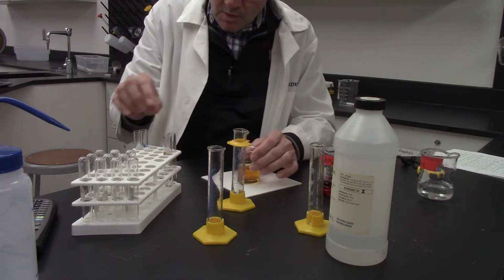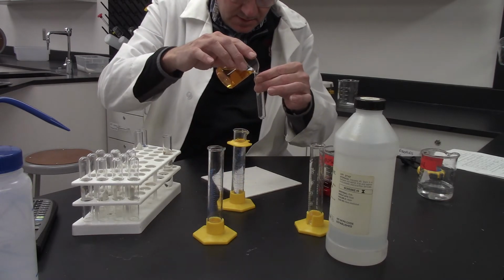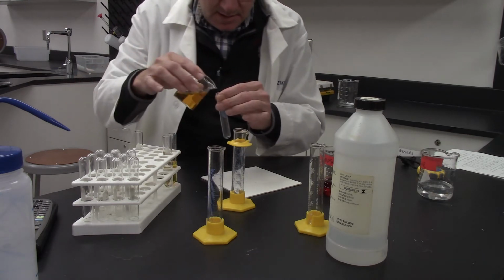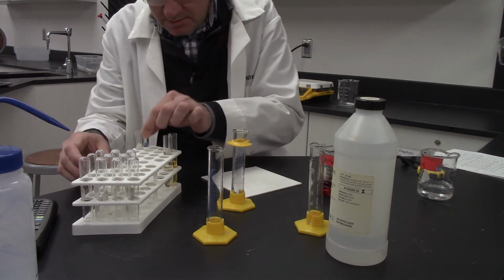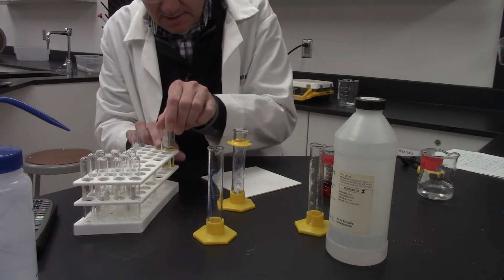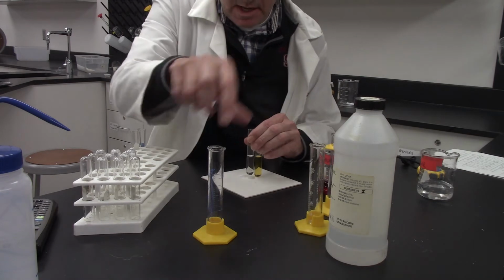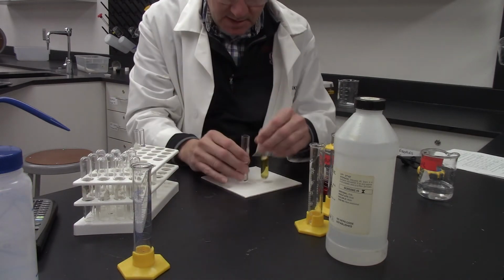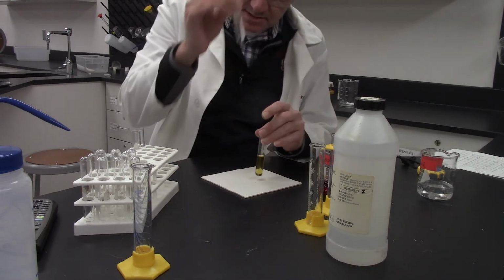We're going to take this and pour it into a test tube like this, and then into another test tube like this. In an ideal world, let's say Danae is my partner. I would be looking at one set of reactions, and I'm going to run this until this test tube looks like this test tube.